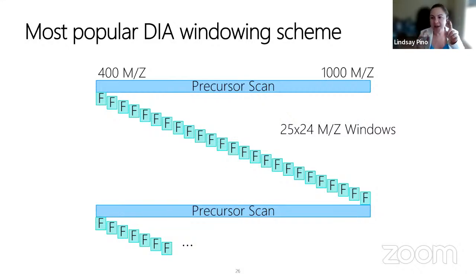If you think back to that ion map, the goal is to try to be covering the darkest part of that intensity across the strip of MZ values. We mentioned that on some of your instruments you're capped by the hardware, how fast you can go.